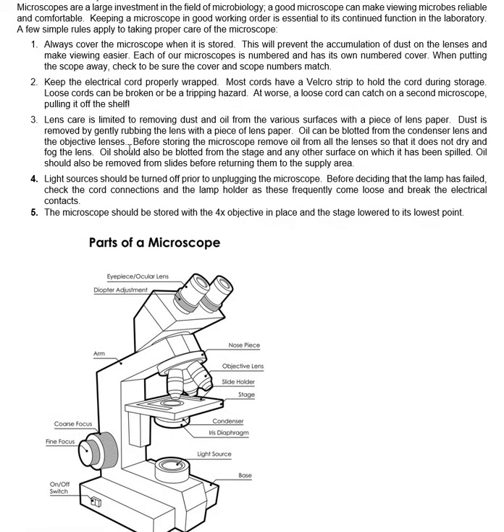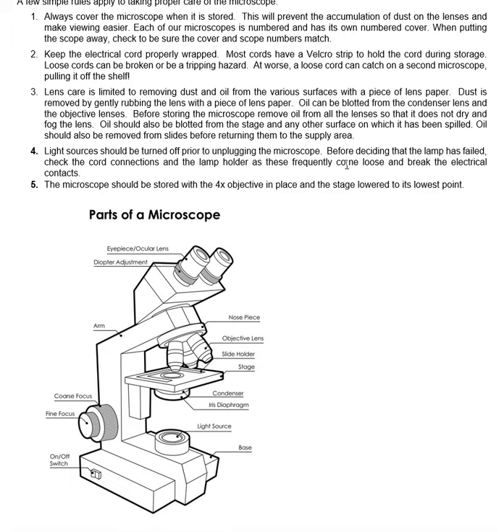Oil you can blot off, dust you just kind of wipe gently. And you turn off the light switch on the microscope before you unplug it. A lot of times the lamp will blow, but a lot of times it's simply a loose connection. So if you have trouble with that, you always talk to your instructor.